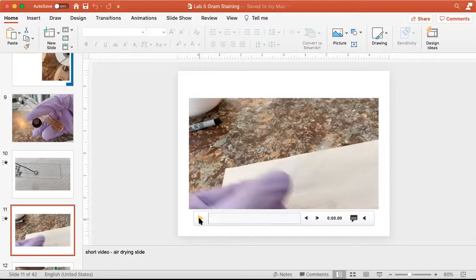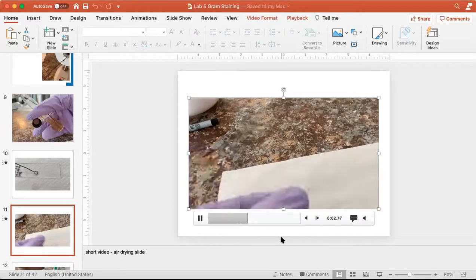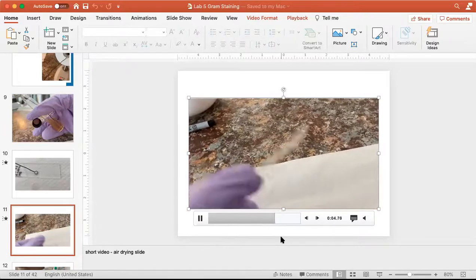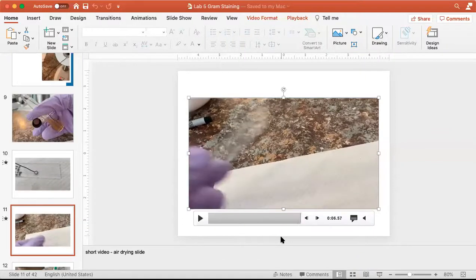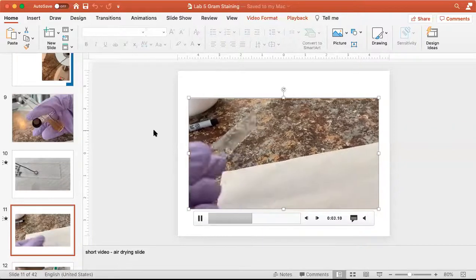We said you can also put your smear on a slide warmer, remember the hot plate sort of device, to dry. The other thing you can do is just gently do this. Remember, microbes can't jump, okay? So anything that I have on this slide is not capable of jumping off.